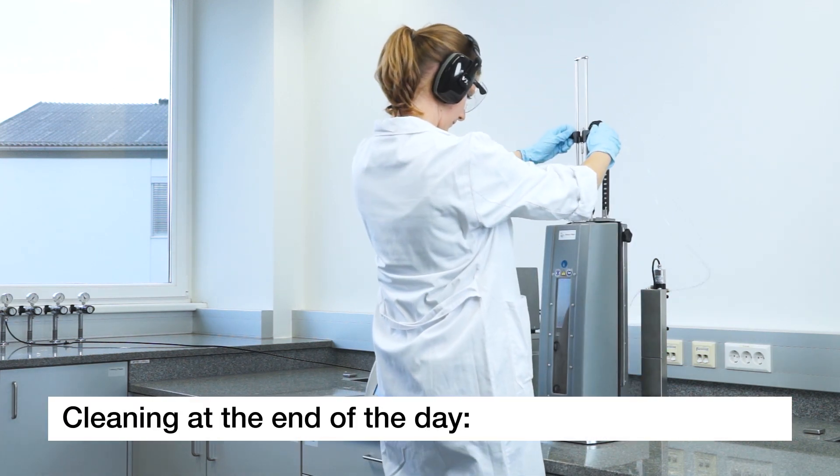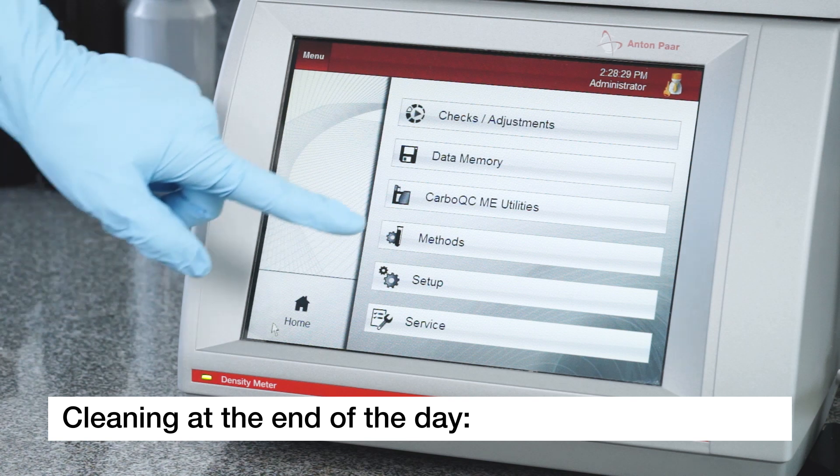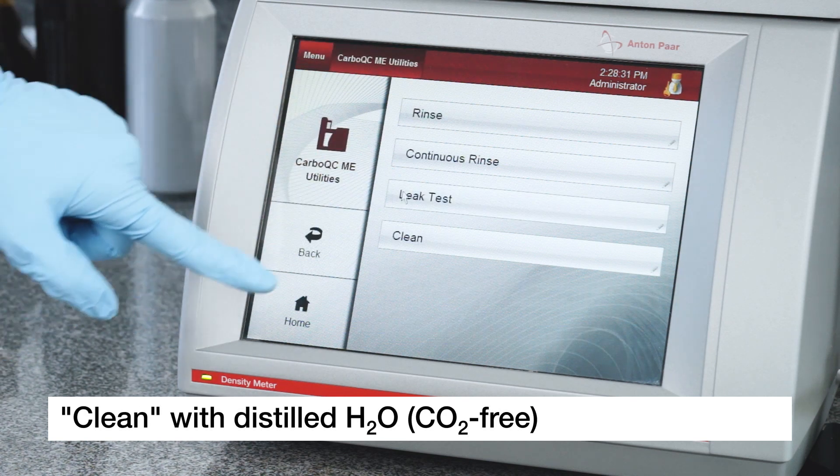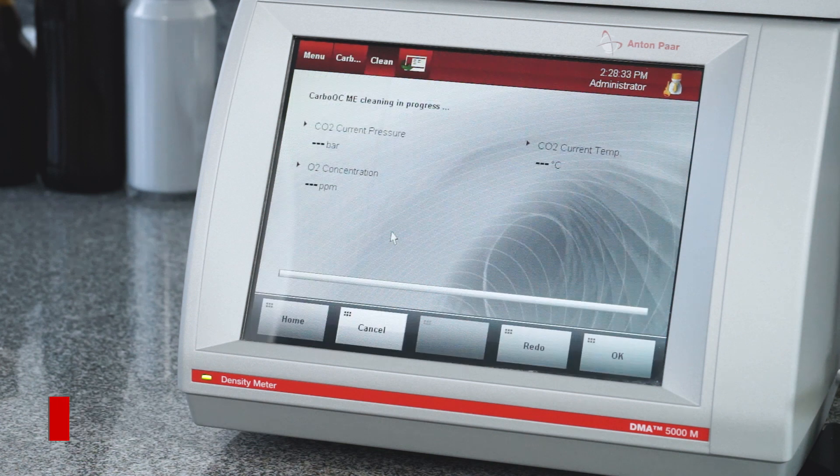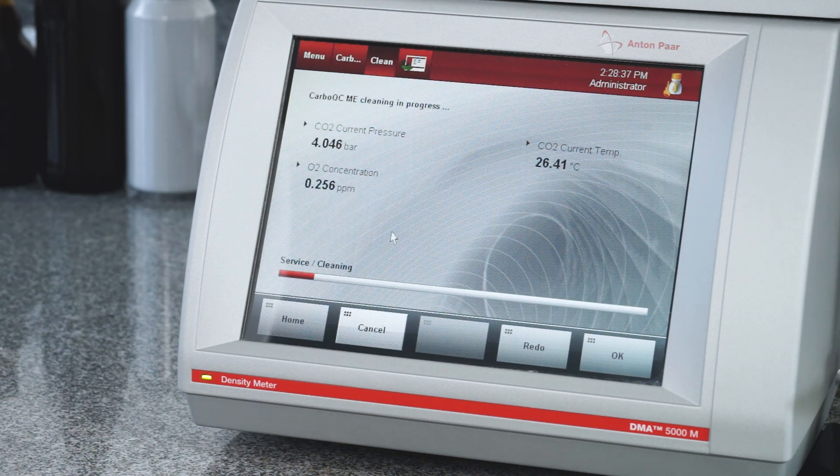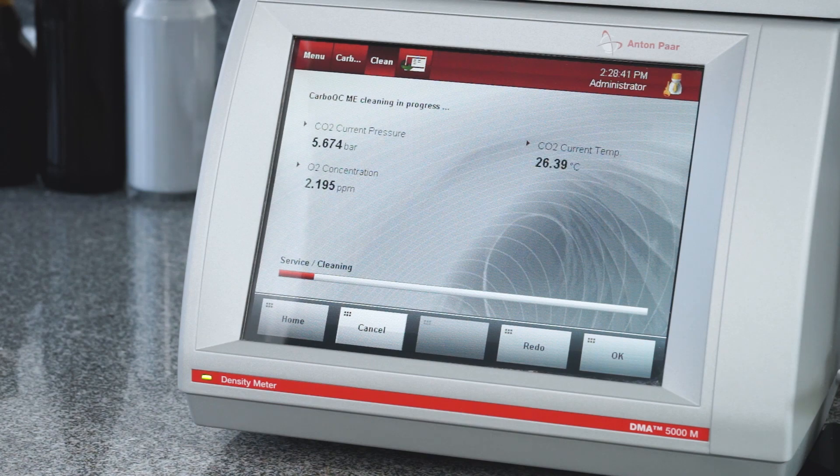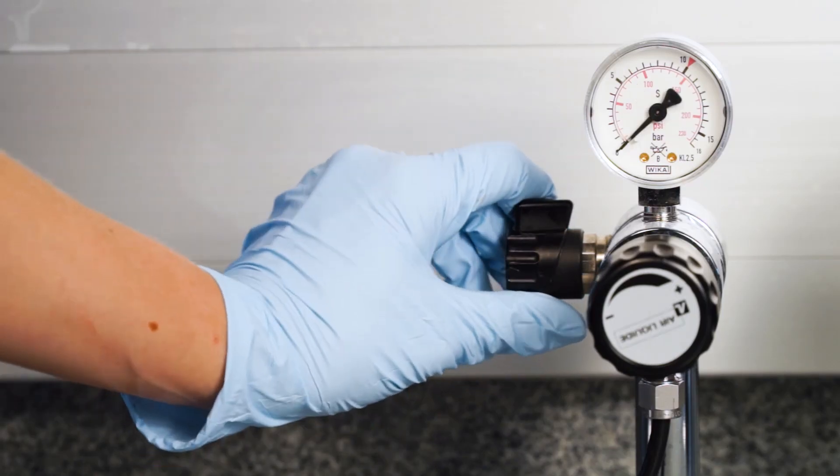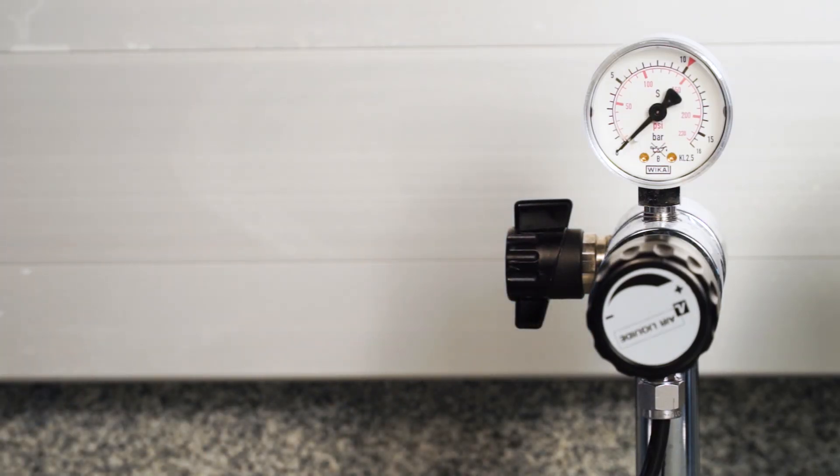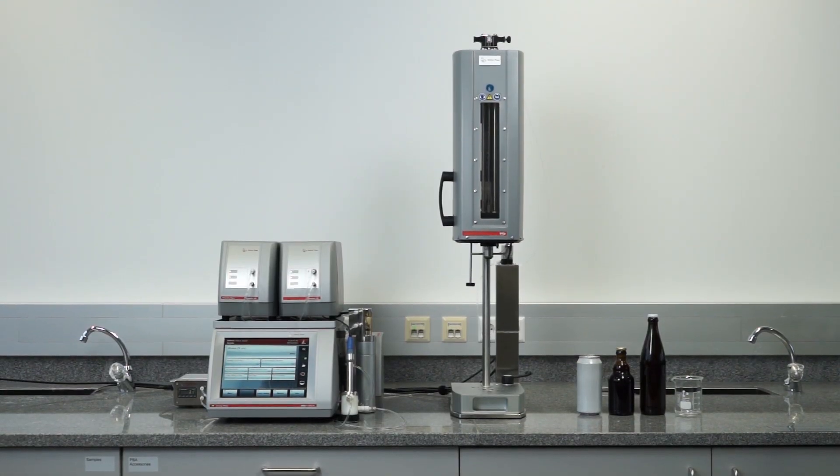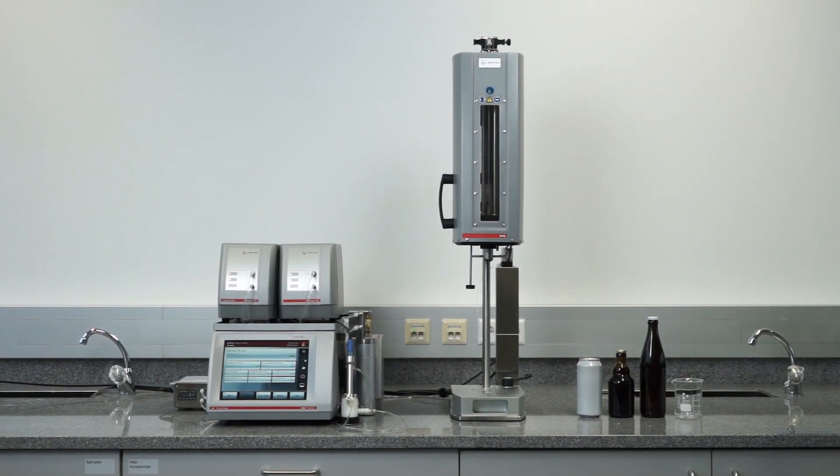For daily cleaning, insert a bottle of distilled CO2-free water instead of your sample. Select Clean to start the automatic process. After about two to three minutes, stop the process again. In case the analysis is stopped overnight for any reason, deactivate the pressure. Now the PBA system is clean and ready for the next measuring cycle.